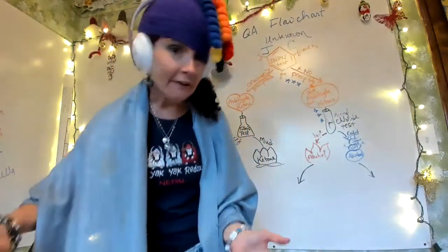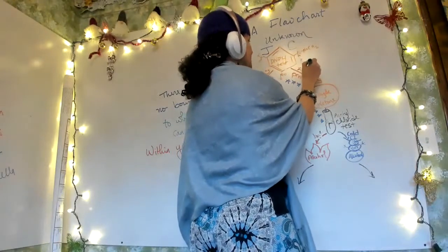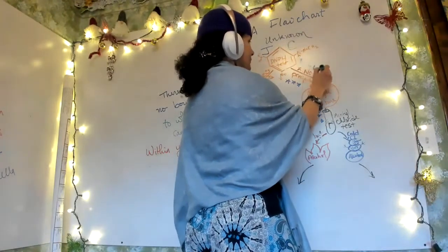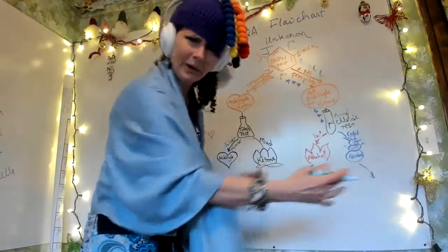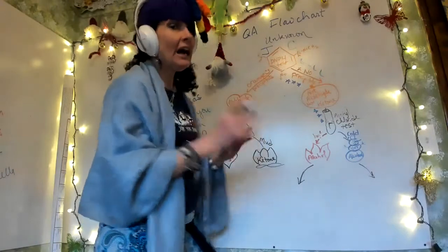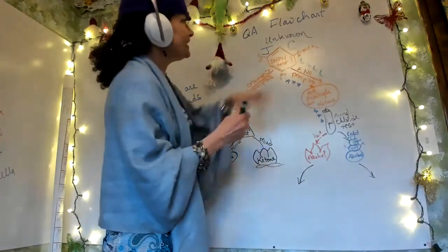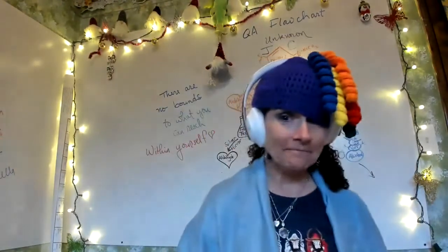And for C, same thing. We went this path. You can do moons. And then from here, one of them I know went hot and one went cold, and that's where it branched out, but neither one was an aldehyde or ketone. But you're still going to show the complete chart, somehow with stickers or little stick figures or something.